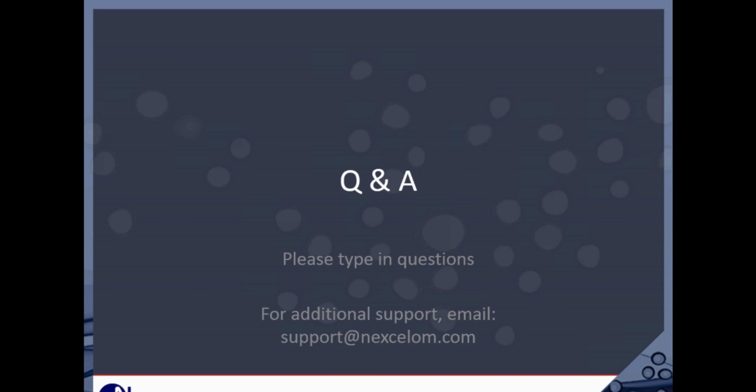Okay, so we do have a couple questions here for Sarah. The first question says, how long can the cells sit in the stain before they begin to fade?